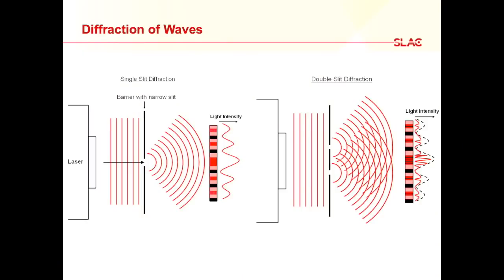All right, so what we try to do, shown simply conceptually here, is we can picture every atom in a material as a slit, in this case a hole in a plate, where you have a wave of light coming in, and as the wave passes through a small hole or is diffracted off of an atom, it changes the distribution of the wave.